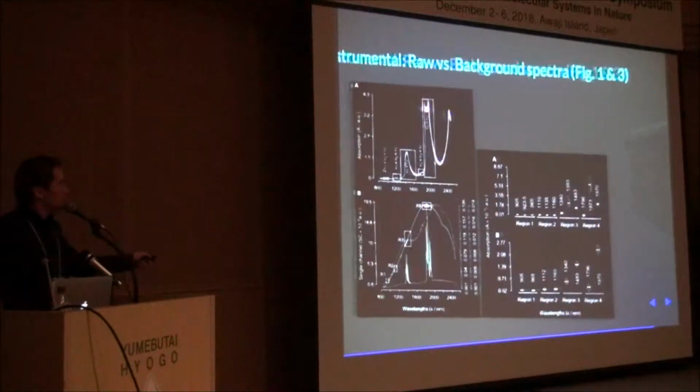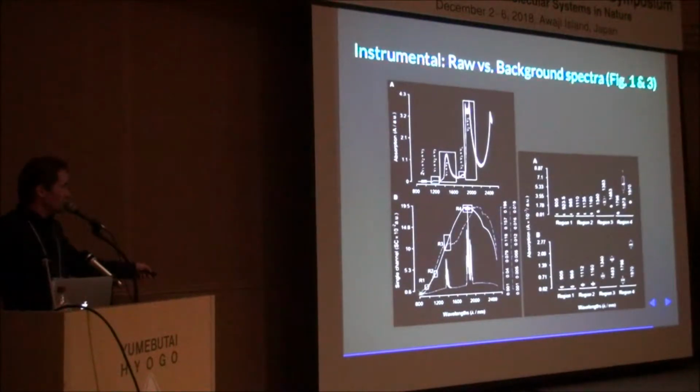Did I put it? No, I didn't. It's not important. Anyway, there are also 2 regions that are not visible, but if you zoom in and properly baseline them, you can see. So there are 4 regions where water absorbs, but the rest of the region is not absorbing. And when I remove these bands and recalculate standard deviation, I get this dashed line.